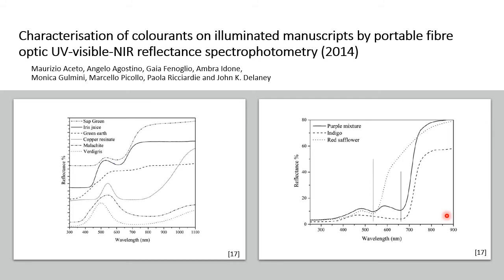The solid line gives us the spectra taken straight from the mixture, and the other two lines show the reflectance spectra that add to make the resulting spectra of the mixture's constituents. As we can see, when there's a mixture, the resulting spectra becomes much more difficult to interpret, which is not the case with Raman spectroscopy. In this particular case, we have to look for the positions of absorption bands rather than the reflectance peaks, as you can see with the two vertical lines added to the graph.